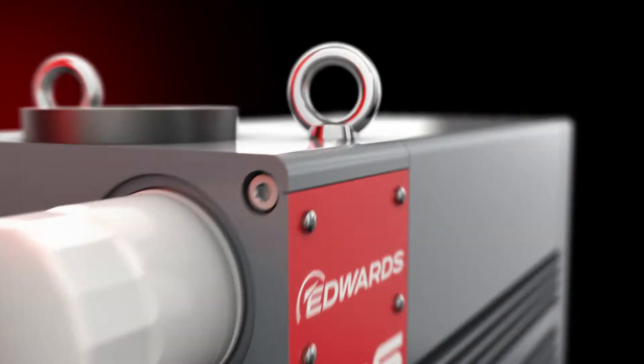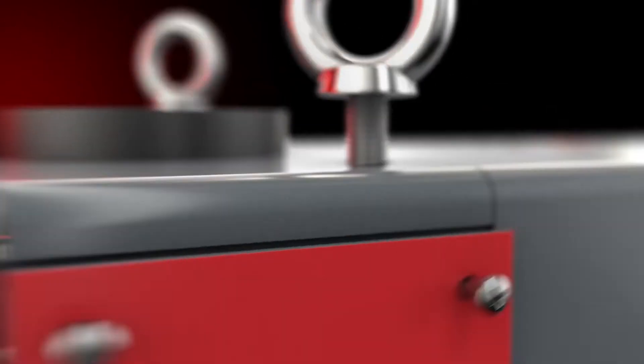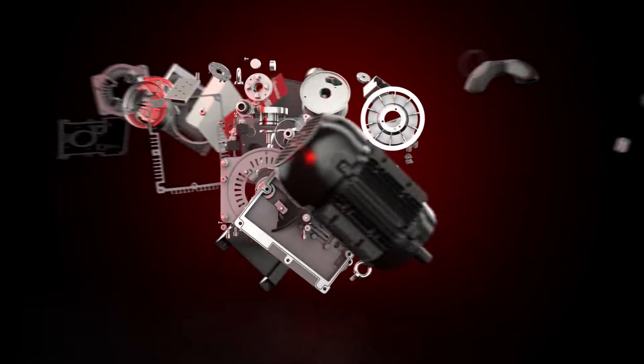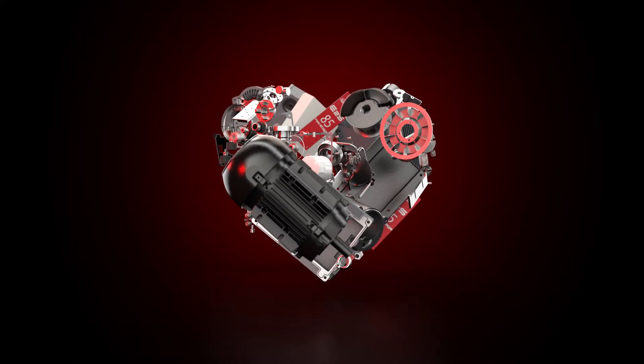Are you looking for a great piece of vacuum engineering that perfectly balances performance, cost, and usability? Then you and the Edwards E2S are a perfect match. Here's why.